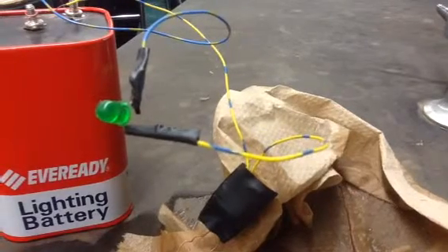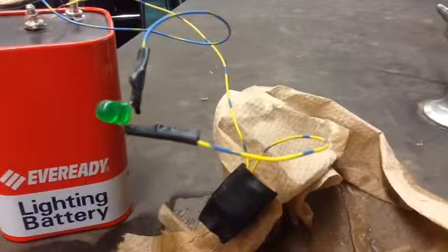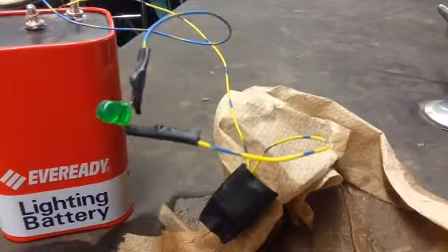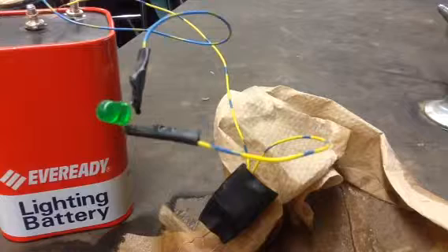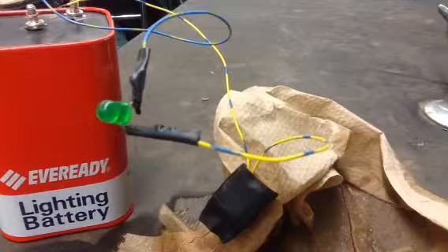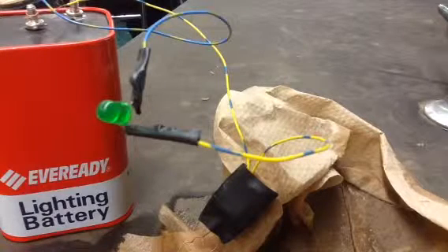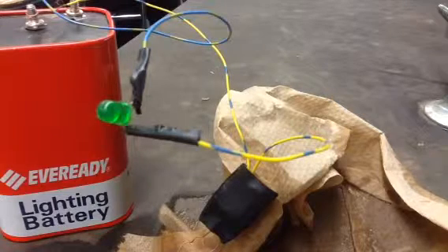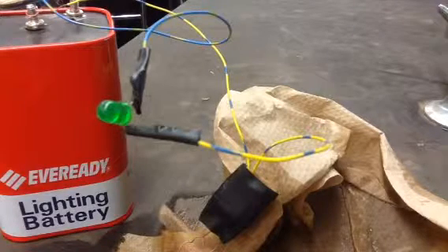Looking at the lab packet, when it asks you to group them into two groups: group your white substances into two. They were all white crystals. Group them into two groups based on their properties. So what properties are you looking at? Conductivity is one of those properties. Solubility in water or ethanol. And what's the other property you tested? Melting point. Now, you don't have specific melting points. You can't say that something melted at 125 degrees Fahrenheit or 400 Celsius.